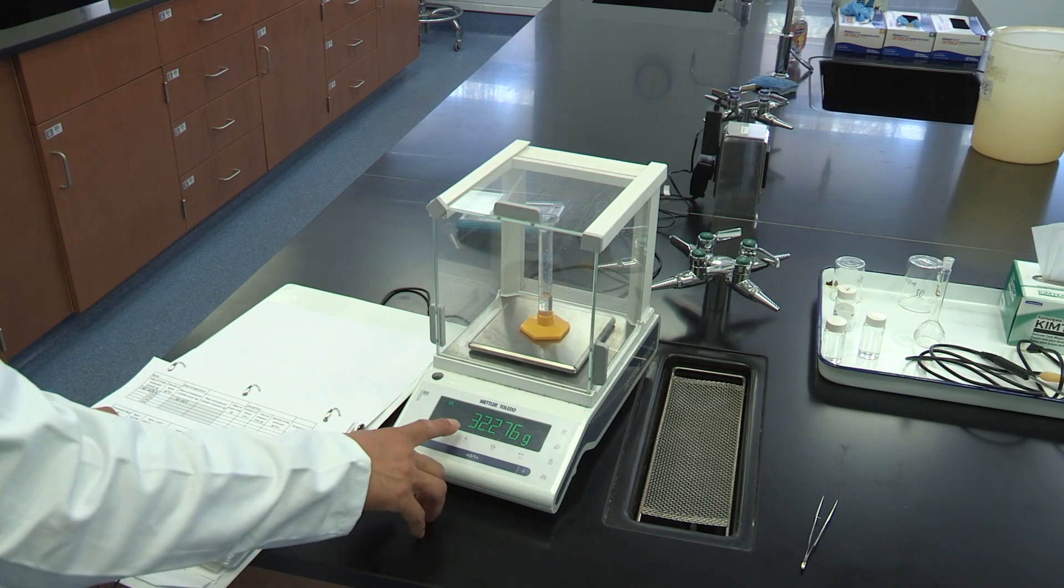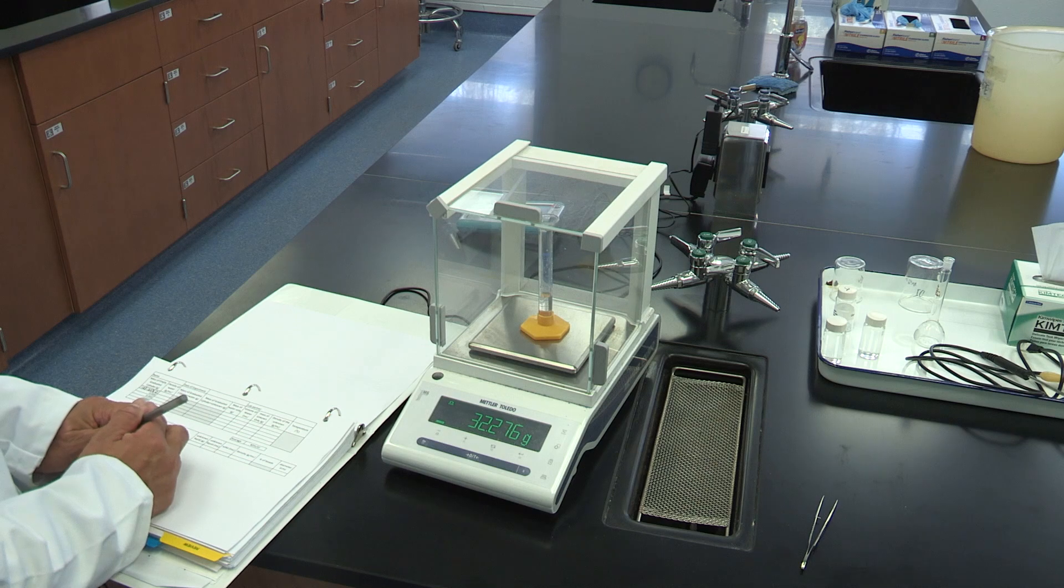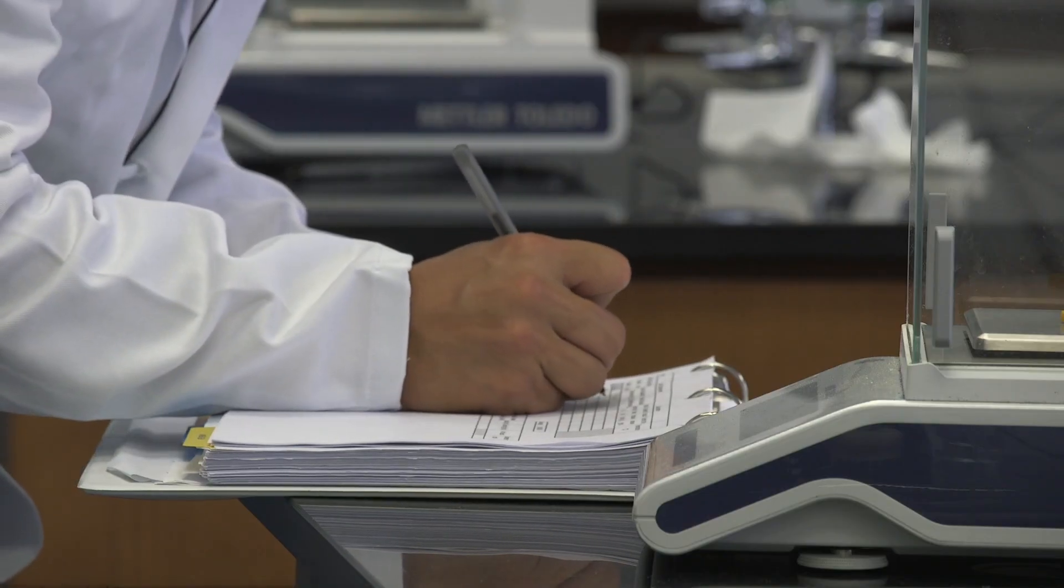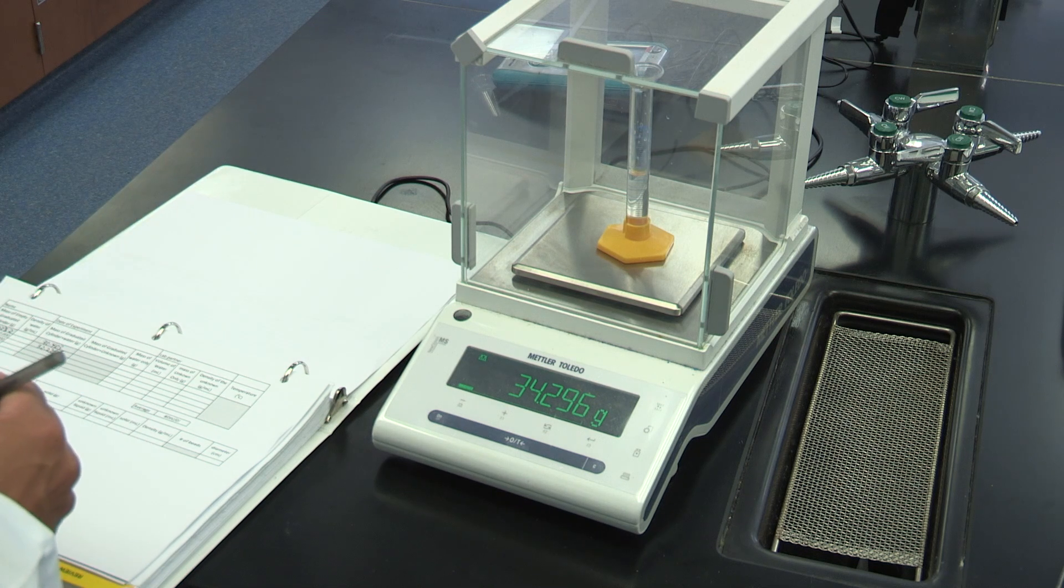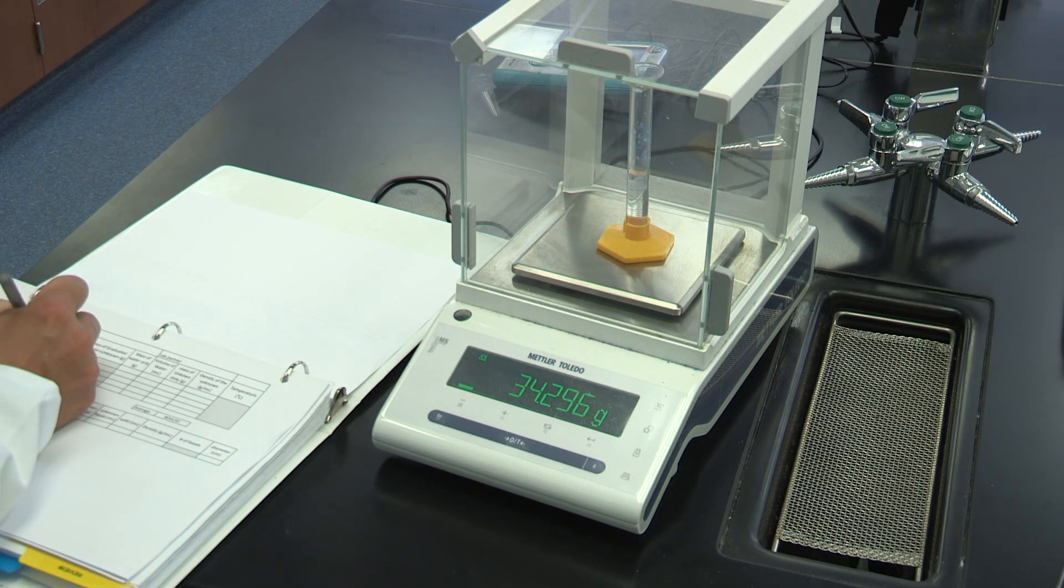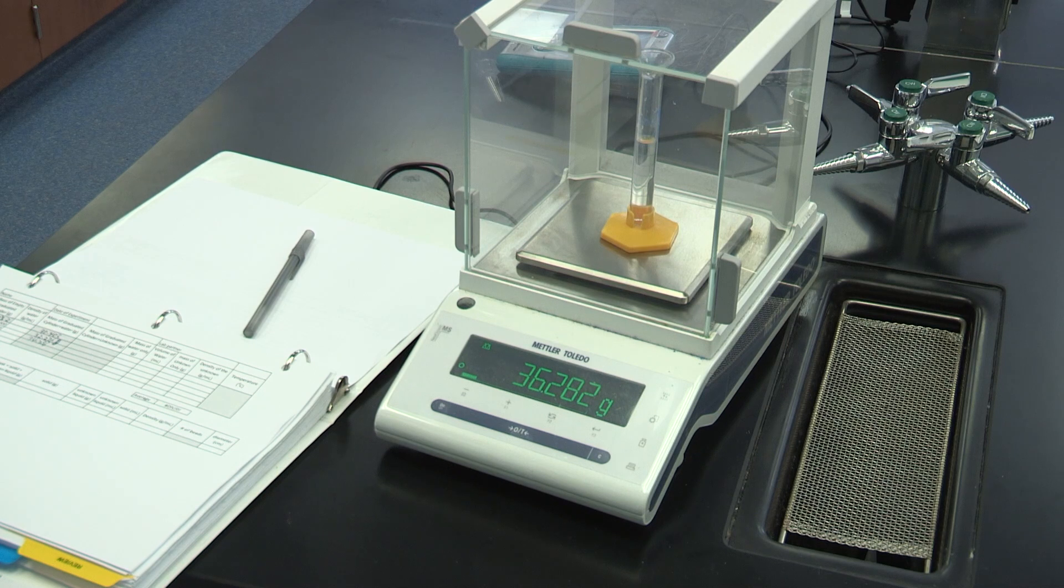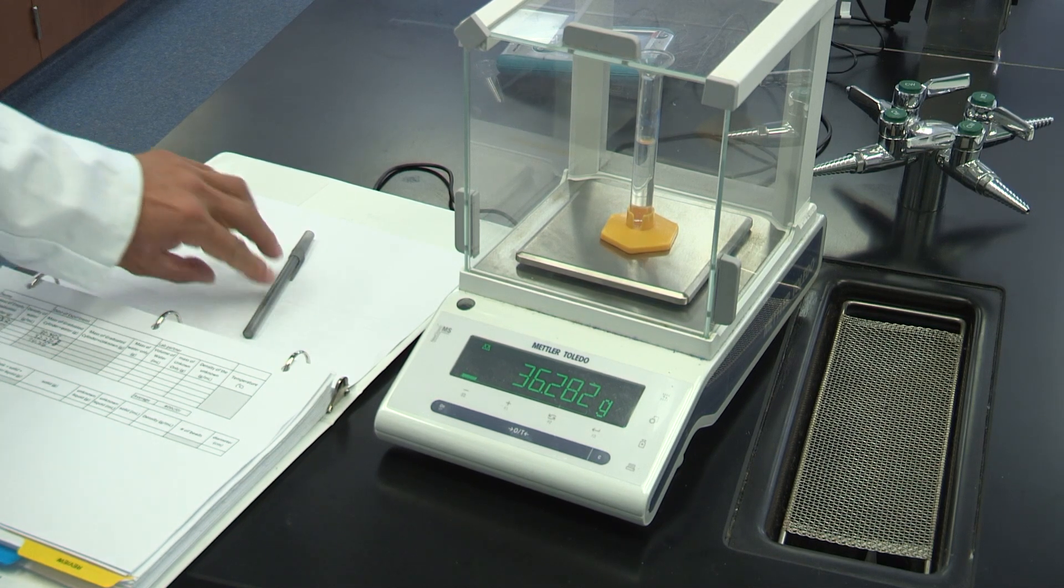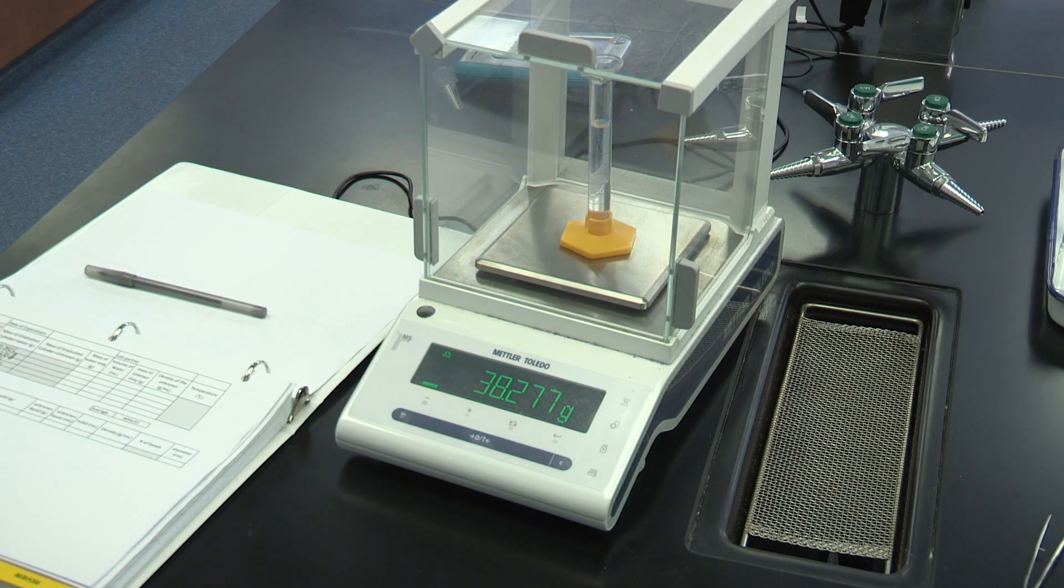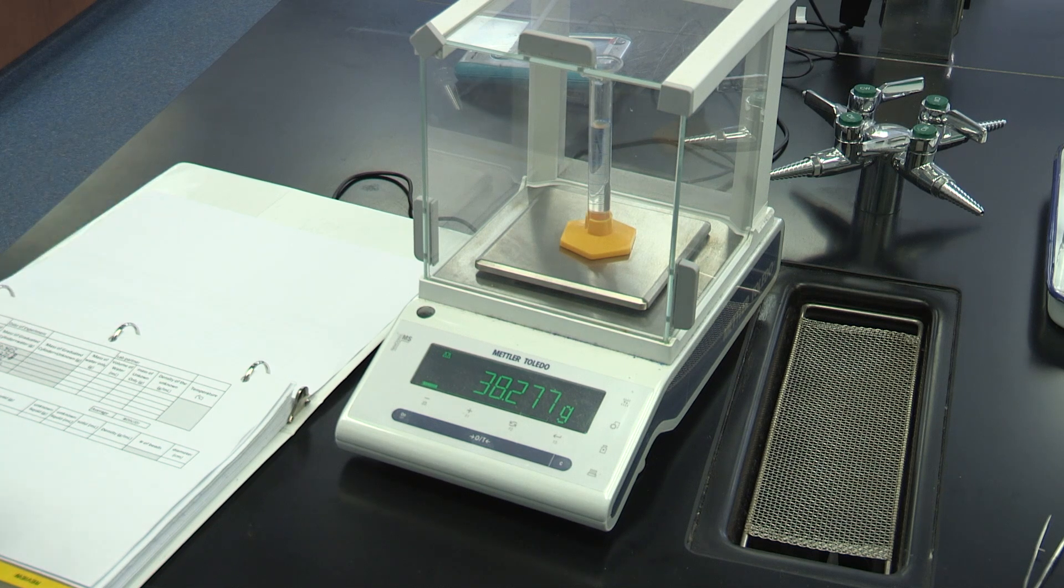4 milliliter mark. The mass is 32.276 grams. Add 6 milliliter mark. It's 34.296 grams. Add 8 milliliter mark. The reading is 36.282 grams. Finally, at 10 milliliter mark. The reading is 38.277 grams.